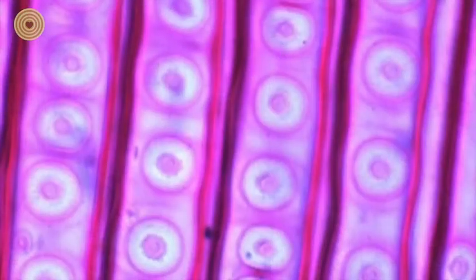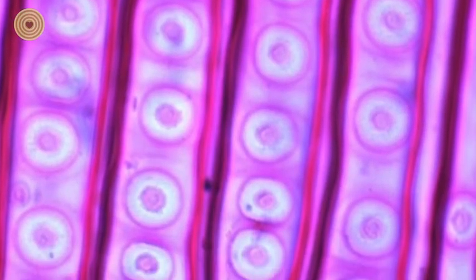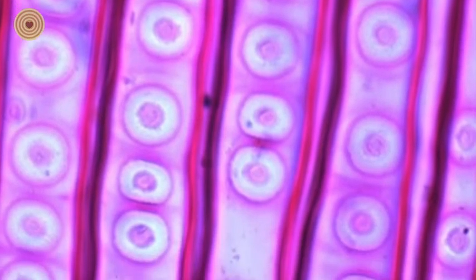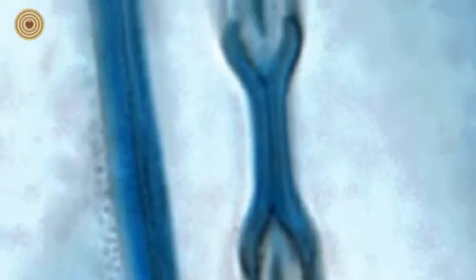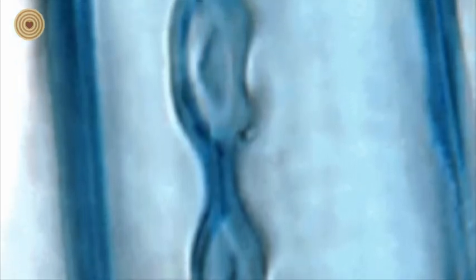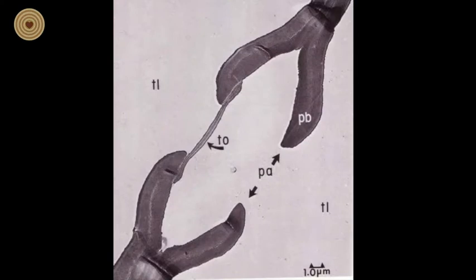The bordered pits can be seen somewhat better in this higher magnification radial view of a series of tracheids. If we slice through these softwood bordered pits and view them from a tangential orientation, we can see that there is a membrane in the interior of the pit with a thickened central region that is known as the torus. Increasing magnification further and viewing using a transmission electron microscope allows us to see a single bordered pit in cross-section. But the torus of the interior membrane has shifted over to one side to block one of the pit apertures that are labeled PA in this image.